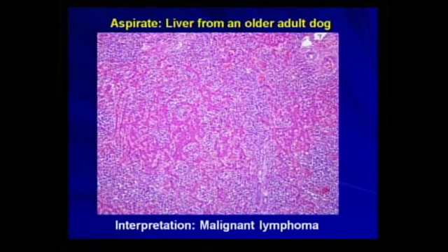I think that almost all of the cytologies that we get routinely from dogs are fairly non-diagnostic. The history is often that the dog has elevated liver enzymes. Perhaps it's mildly hypoechoic on ultrasound, and somebody figures that a very cost-effective method will be to stick a needle in there and see if we can come up with something.